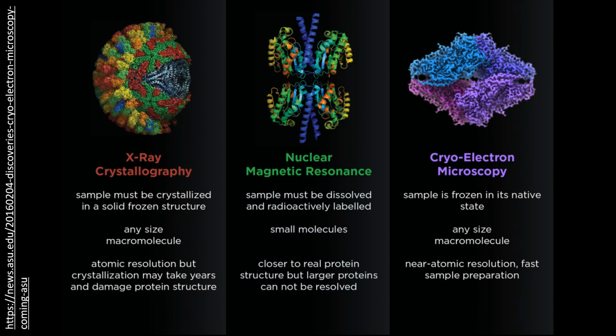It works on any size macromolecules. A drawback is that some proteins cannot be or are hard to crystallize. Cryo-EM works on those proteins, however. Crystallization can sometimes cause unnatural conformation changes that are thus functionally irrelevant.